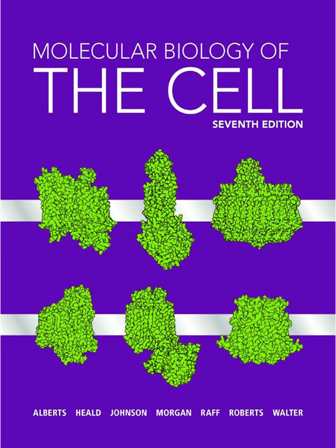And you mentioned FRAP earlier, fluorescence recovery after photobleaching. Right, FRAP. That's different. You use a strong laser to deliberately bleach or destroy the fluorescence of GFP-tagged molecules in a small area of the cell. Okay, so you create a dark spot. Exactly. Then you just watch and measure how quickly unbleached fluorescent molecules from the surrounding area move into that bleached spot. Ah, so it tells you how mobile the molecules are. Precisely. You can measure diffusion rates, see if molecules are actively transported, or determine how long they stay bound to structures by how quickly the fluorescence recovers. It gives you quantitative dynamic information.